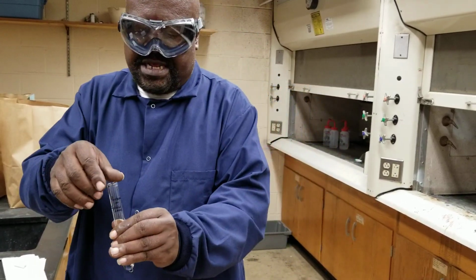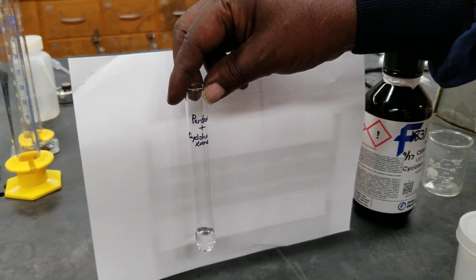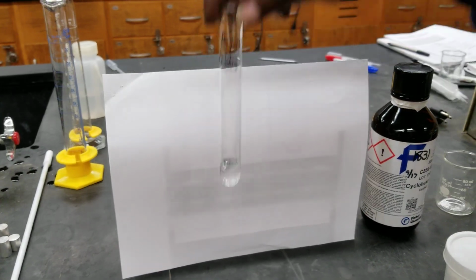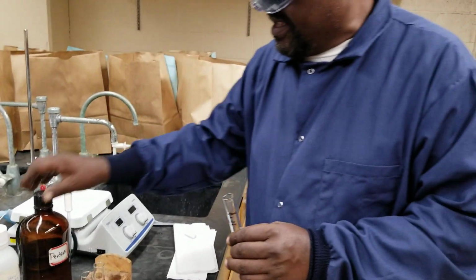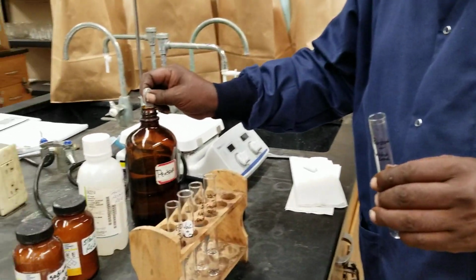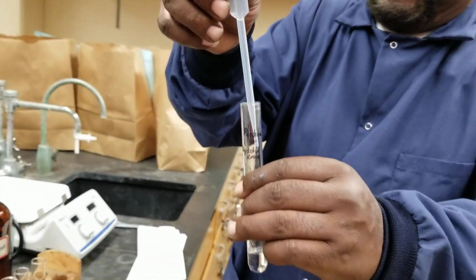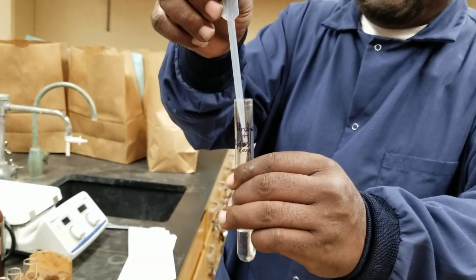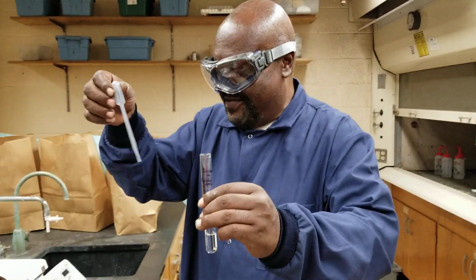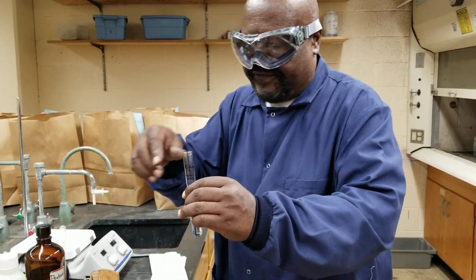So the first one is pentane as the solute and cyclohexane as the solvent. I have cyclohexane in here, and I'll get some pentane, a little bit, or a lot in this case. By the way, I don't know if you noticed, it was just dripping out of the thing here. There's a good reason for that we'll understand later. So I've gotten the two.